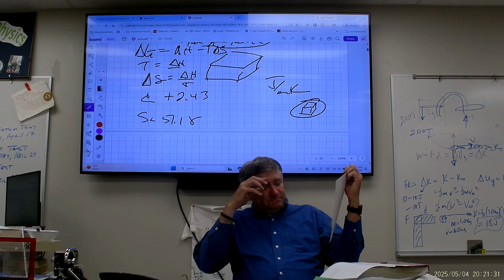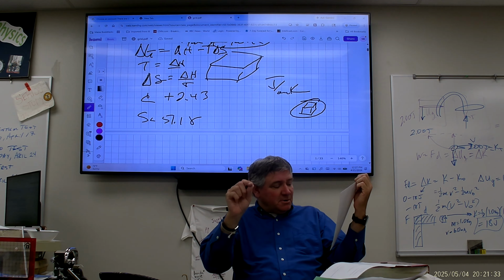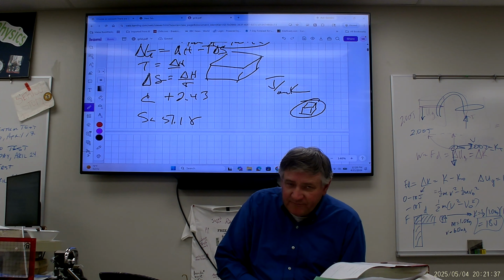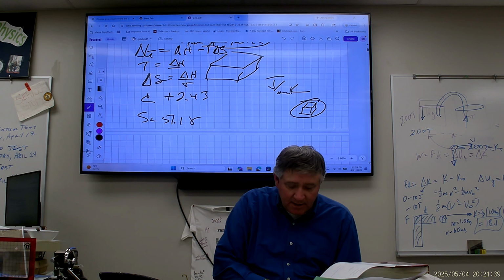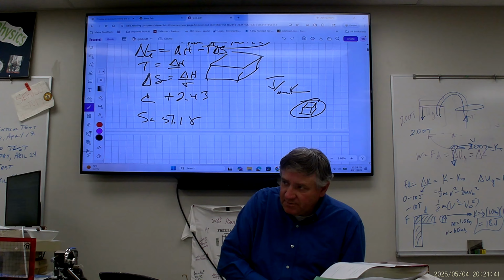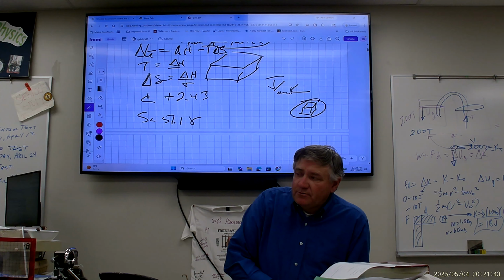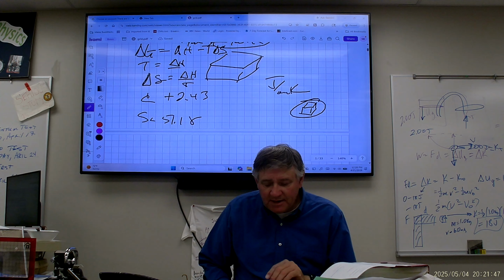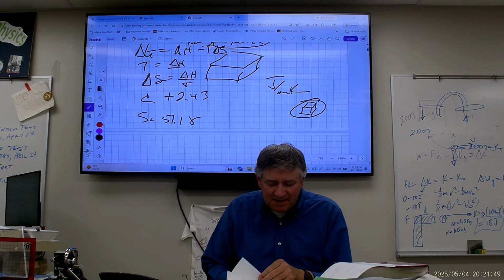So you're going to come up. I'm going to give you a small piece of sodium. I'm going to drop that in water, to which you have also added phenolphthalein indicator. Okay? And you're going to measure the initial temperature, and then we're going to drop in the sodium, and then you're going to measure the final temperature. Now, there's one glitchy thing, and it's still going to work.